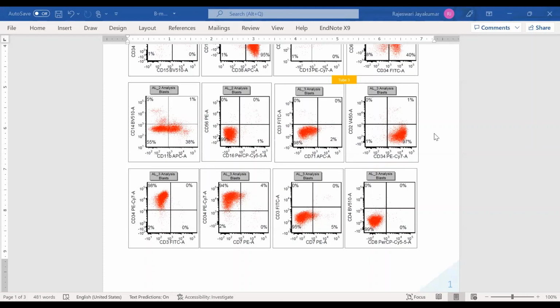Sometimes you have 2 distinct clusters of monocytic and B lymphoblasts, or any 2 distinct lineage clusters. If that happens, you don't necessarily need 20% on each of those clusters to call it acute leukemia. Altogether, if you get 20% blasts, that's enough to call it acute leukemia.